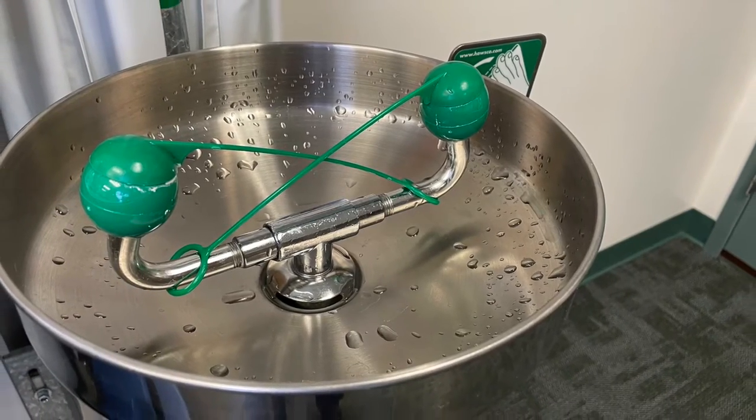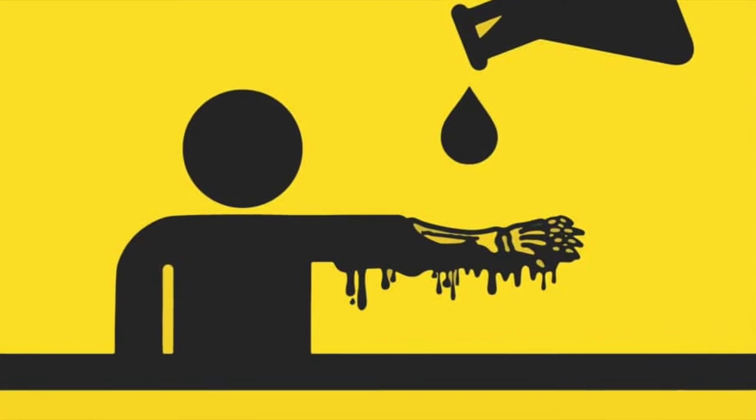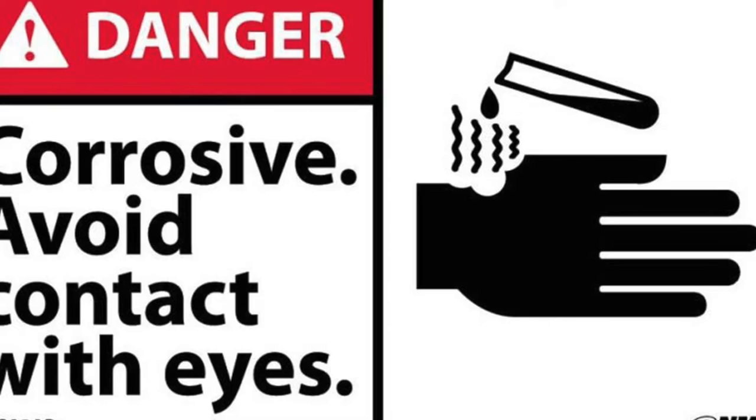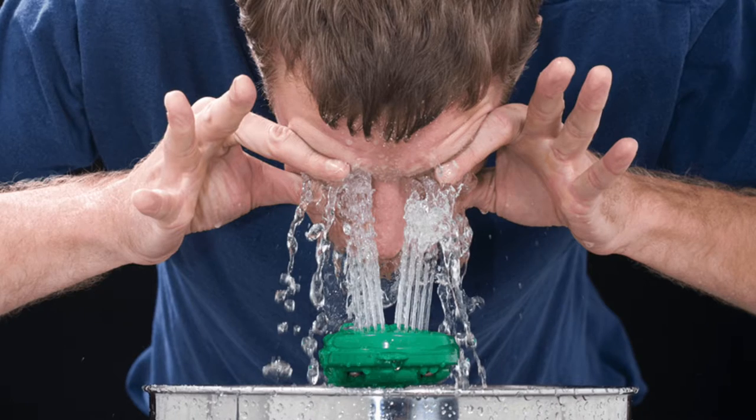Safety eyewashes and showers need to be provided in areas where corrosive and other injurious liquids are used. Having quick drench facilities can significantly reduce the damage hazardous liquids can cause to your skin and eyes.